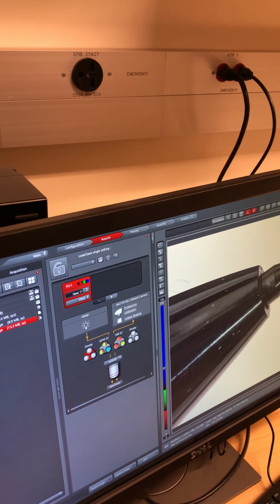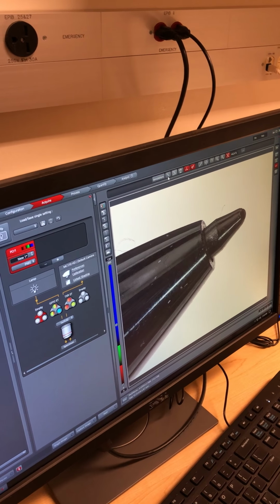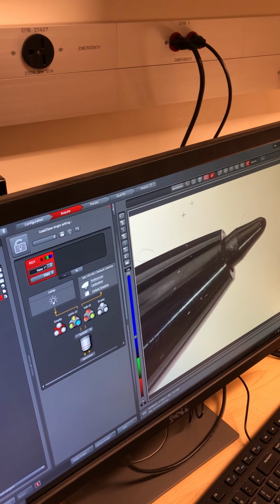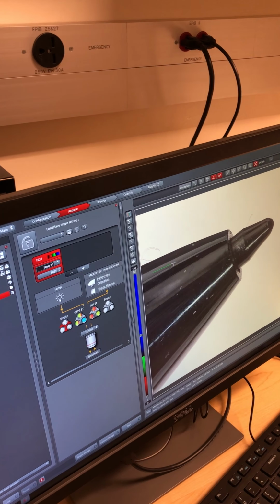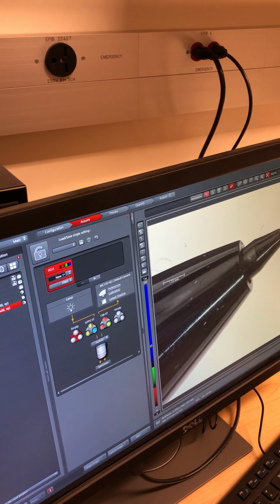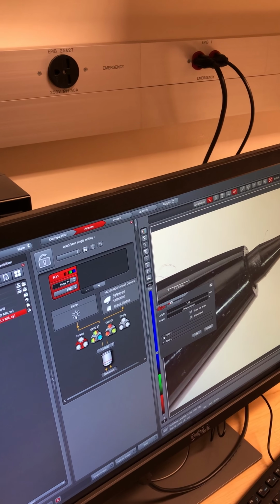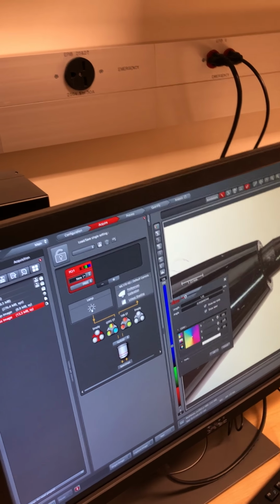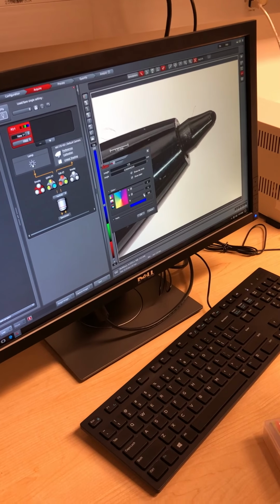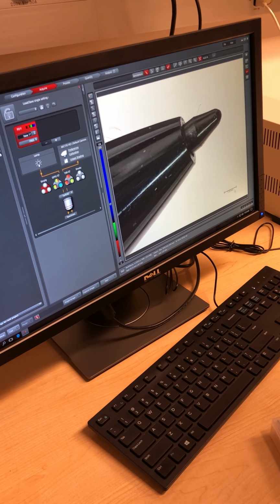So we can draw. Well, here's the deal. I would like to be able to do a scale bar. It'd be nice. So there's the scale bar. The problem is the background there is white. You can't change the color. Yeah, you can. So I'm going to change it to black. Oh, I see. It was there, but you just couldn't see it.